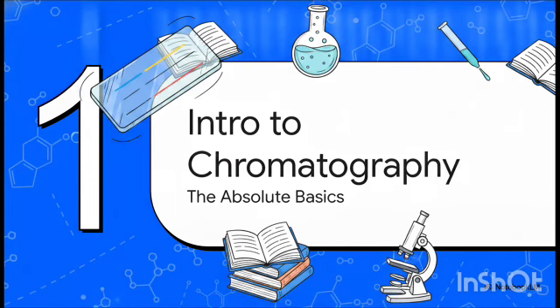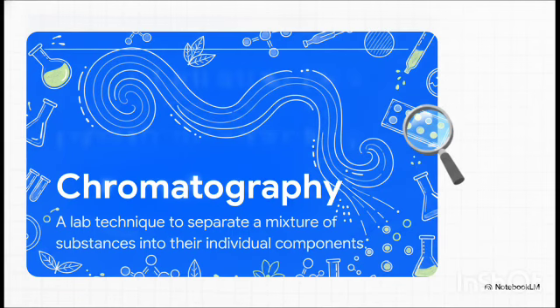Section 1. Intro to Chromatography. Okay, so before we can analyze anything complex, we obviously need a reliable way to pull its individual pieces apart, right? Imagine you've got this incredibly complex, messy soup of chemicals extracted from a plant leaf. You can't just eyeball that mixture and know what's in it. Chromatography is the laboratory technique that allows us to elegantly and precisely separate it into its individual, isolated components so we can actually study them.